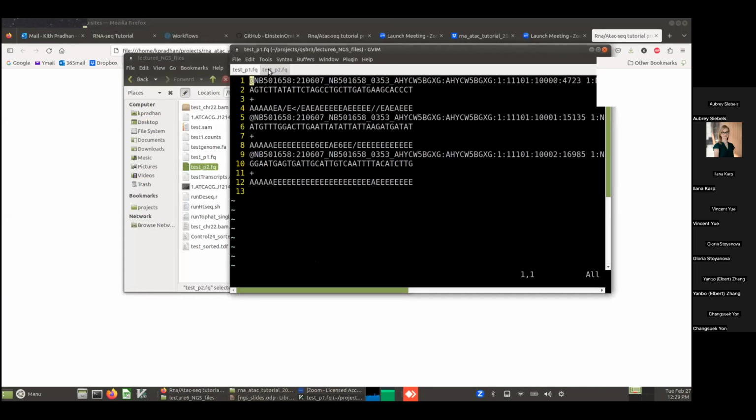And here is just two ends, two mates, of a single sample. This is just the first 3 reads. Basically every FASTQ file has this format where there are 4 rows that make up information about a fragment. The first row is this big, weird, complicated symbol. This is just a unique identifier for the actual fragment. Sometimes they have information on the lane, maybe the date that the data was generated. But basically, you can think of this just as a name.